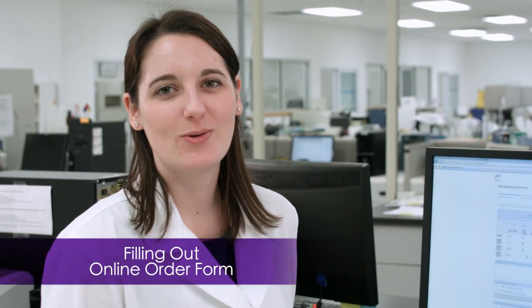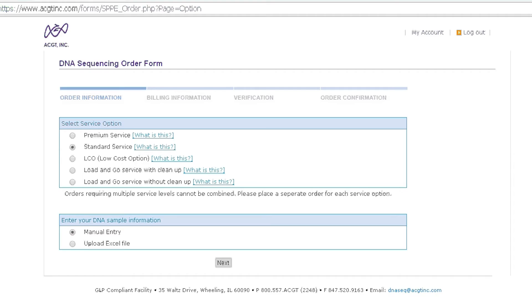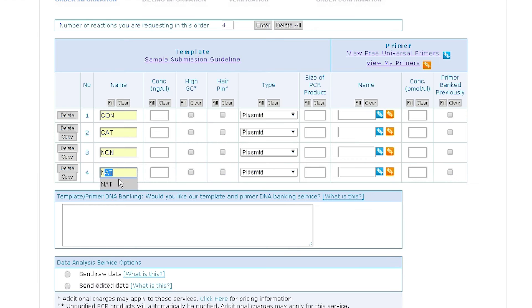Now that we know that we have quality DNA based off our gel picture and nanodrop, we'll go through the process of sample submission. For standard service orders, simply fill in the nanodrop reading for the sample into the order form.